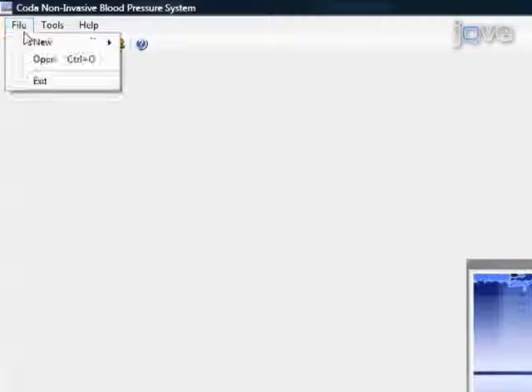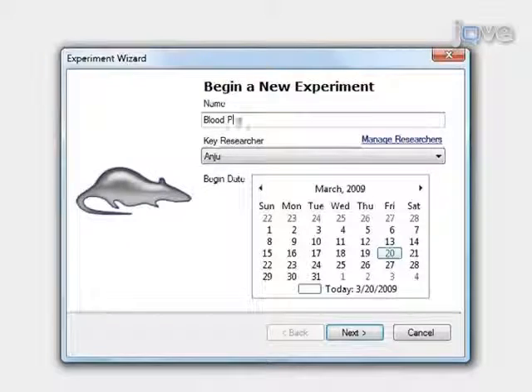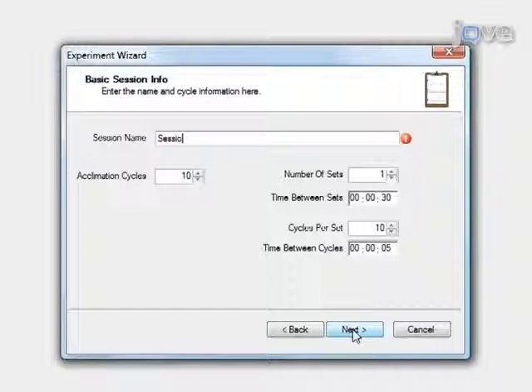To begin a new experiment, select File, New, Experiment. Enter the experiment name, select the key researcher, and select a begin date. Click Next. Enter the basic session information: start by entering the session name. Set Acclimation Cycles to 5 — if you prefer not to include acclimation cycles, set to 0. Set Number of Sets to 1, Time Between Sets to 30 seconds for multiple sets, Cycles Per Set to 20 cycles, and Time Between Cycles to 5 seconds. Then click Next.